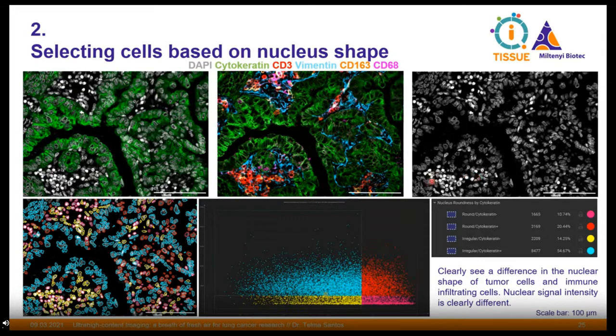And you can clearly identify the non-tumor cells just by looking at the nucleus, at least in some areas. The nuclei of the tumor cells are very irregular and even have lower intensity. These ones seem to have holes. They seem to be hollow. So this is a feature that is extracted from our data, so it can be plotted against other features.